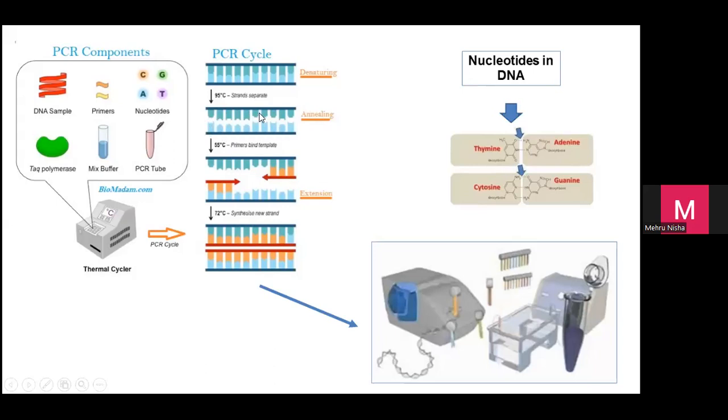So kita ada forward primer, kita ada reverse primer. 5' to 3', 3' to 5'. Dia akan baca. So primer ni selalu kita ada just around 20 base pair saja, around 20, 16. Pendek, dia tahu mana nak lekat. How dia lekat?